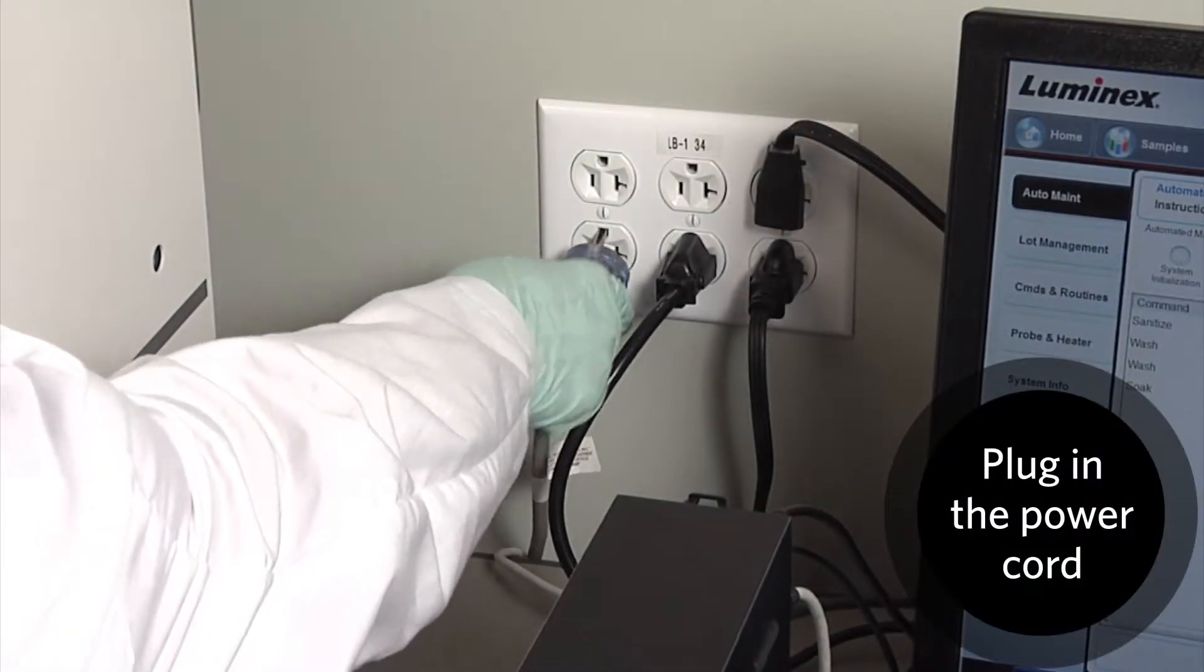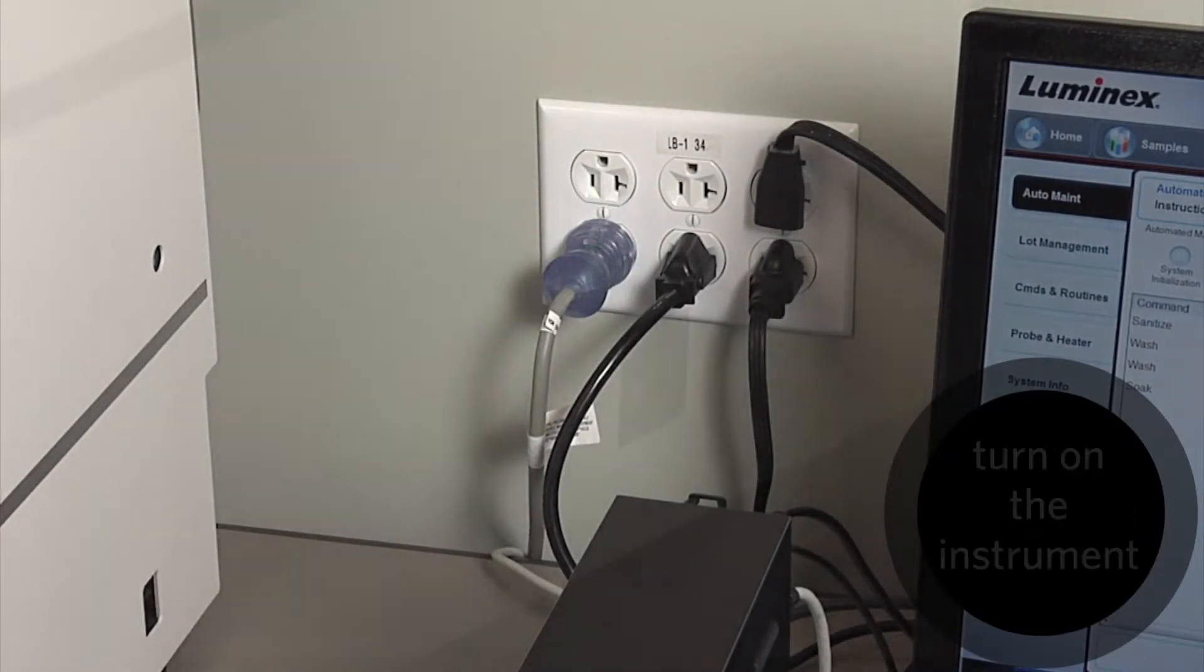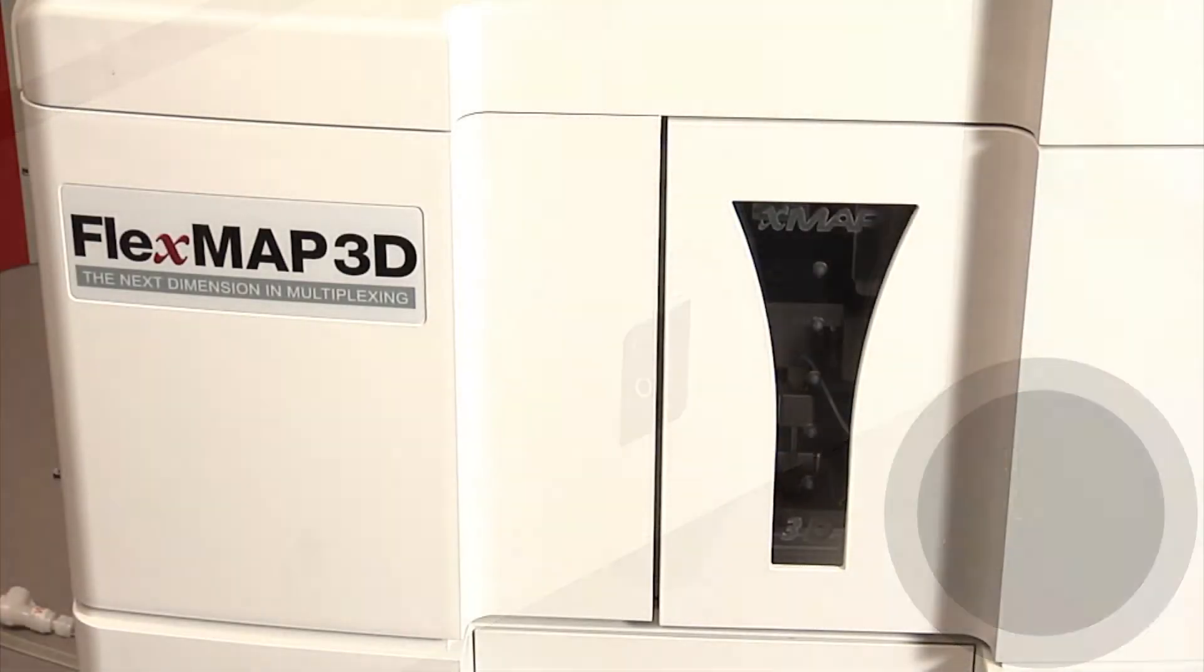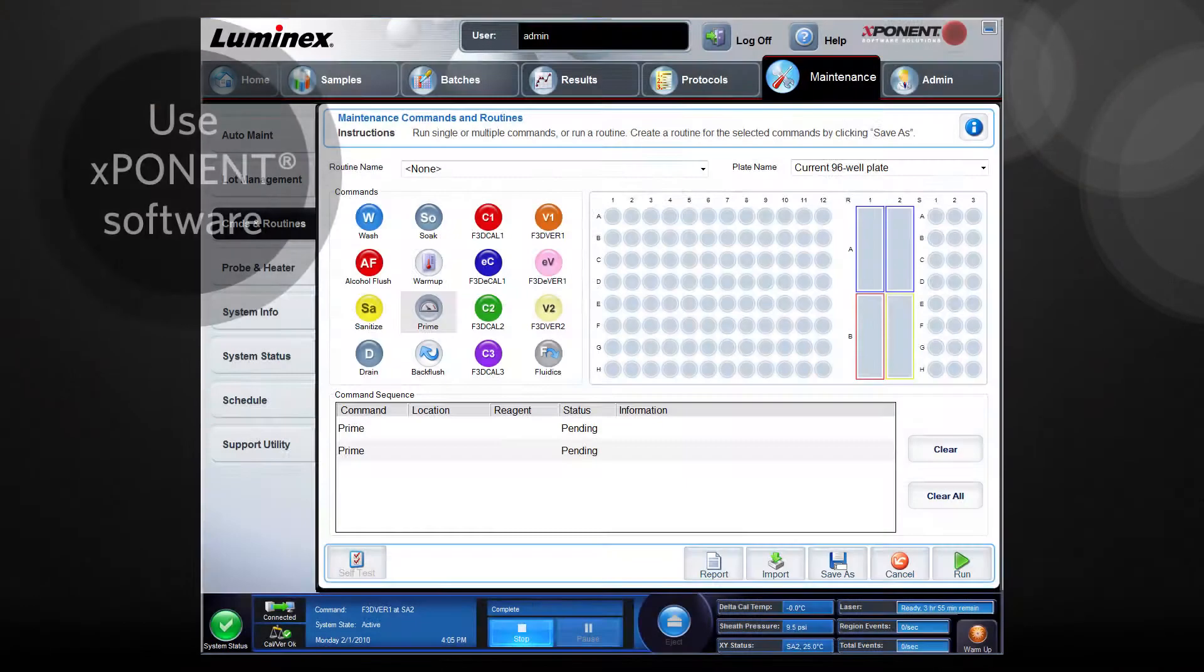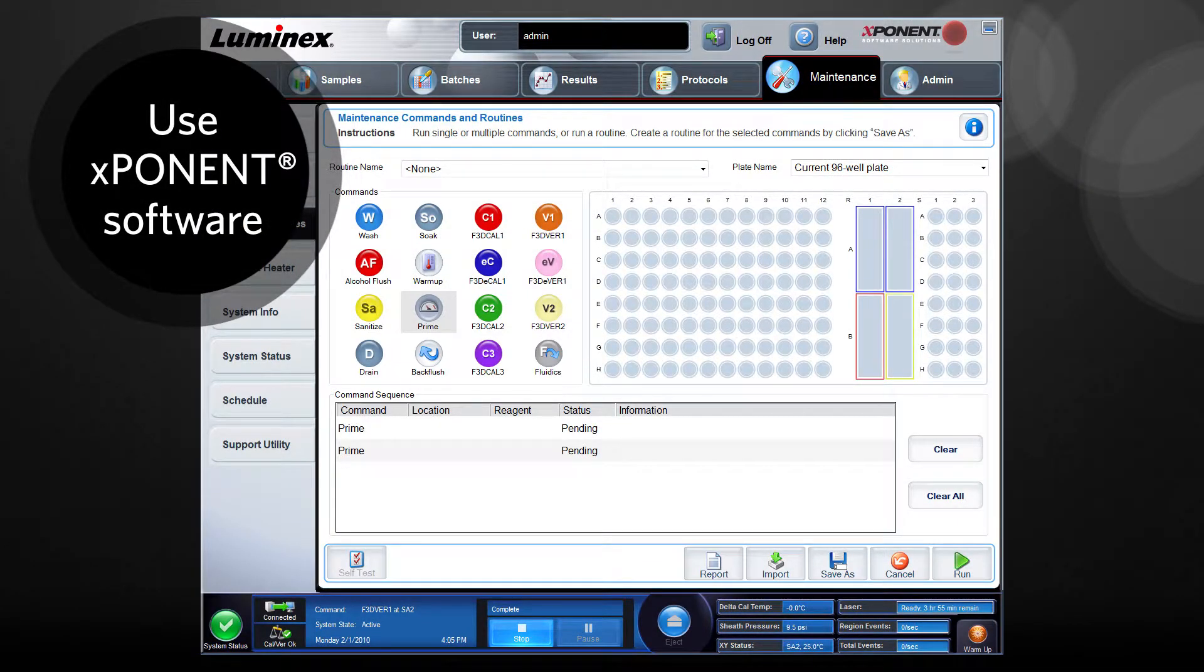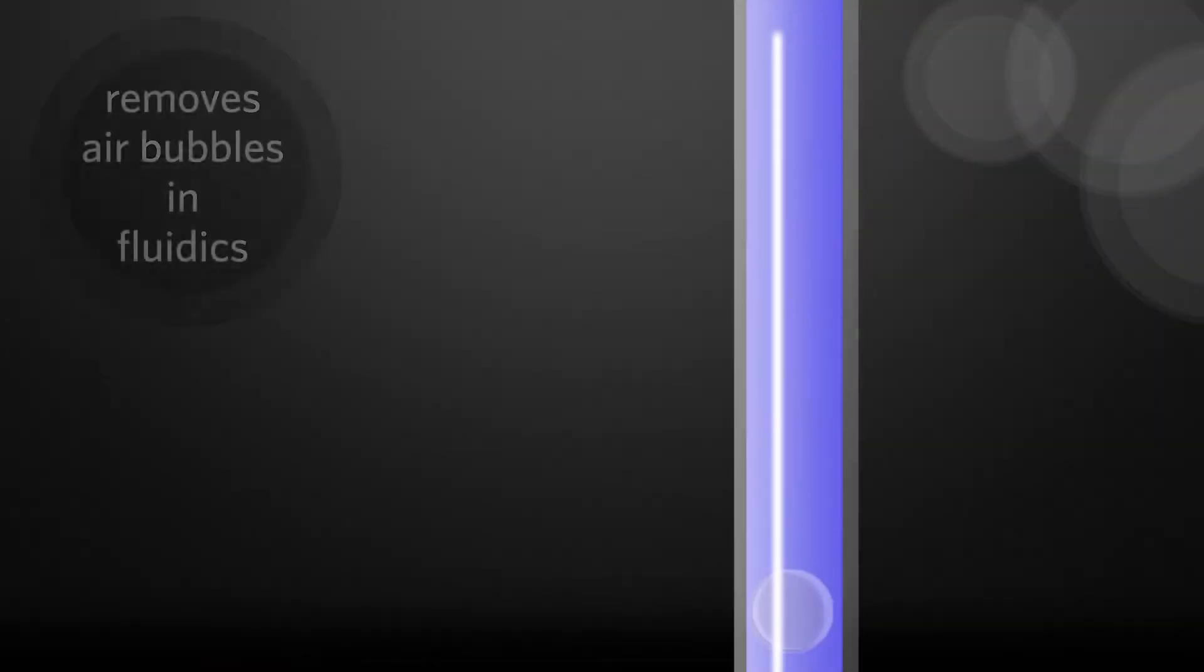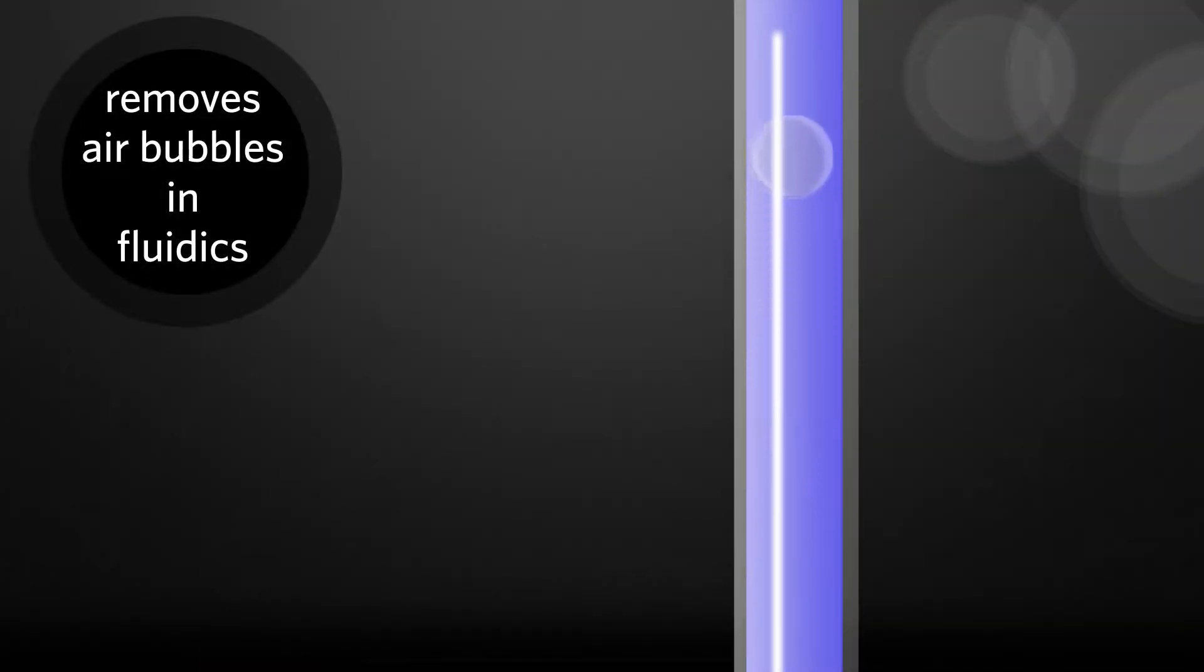Plug in the power cord and turn on the FlexMap 3D instrument. Using the Exponent for FlexMap 3D software, run the prime command twice. This will remove any air bubbles in the fluidics lines.